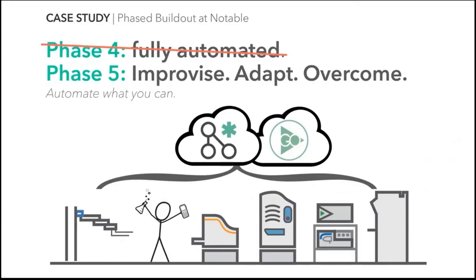And although this isn't a fully walk-away process, we found that this phase was still very helpful to our scientists as they were able to leverage our automated systems to run this new assay at scale and with a short turnaround time at the small cost of still requiring people to intervene at points in the process.